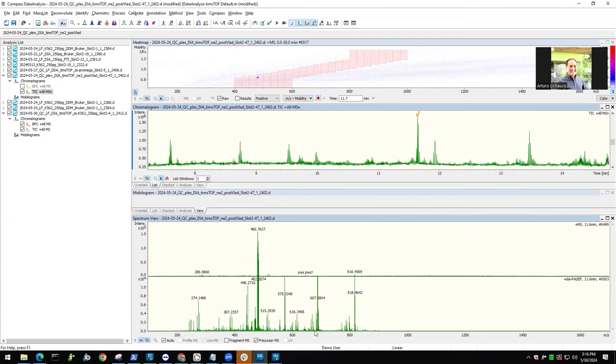It's the timsDIA-NN version on ProteoScape. It's based on a previous DIA-NN version, and this version wasn't able to do that. And I think our bioinformaticians have really implemented it. But yeah, with the standalone DIA-NN version, you can do that.